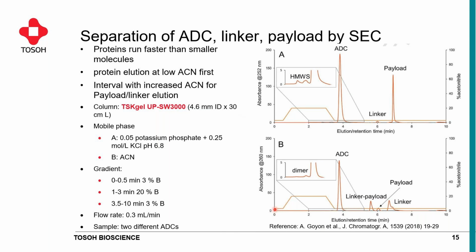So the protein will probably only be exposed to this low organic solvent throughout the run. Now, what we said before, we don't want any interaction between the analyte and the stationary phase. Is not as true, unfortunately, for our payload or linker. This is what we have seen before.